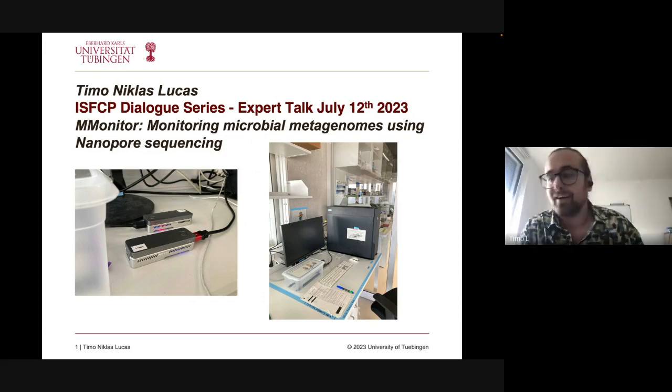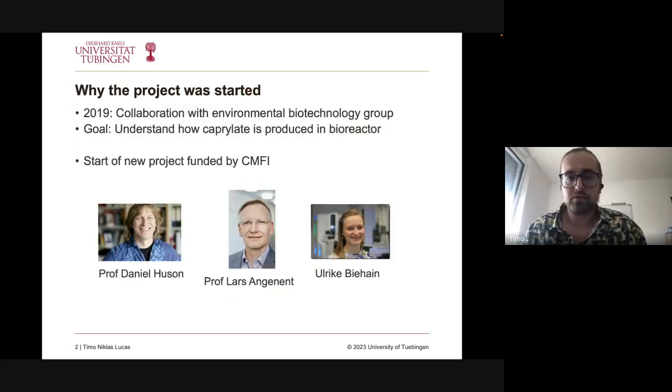Thank you. Although I have to correct you, I'm not a doctor yet. I'm just a PhD student, but I hopefully will be soon. So as was just said, I'm working with nanopore sequencing. I created a software to help with nanopore sequencing to track microbial communities in a setting in bioreactors. But I will tell you more about this soon.